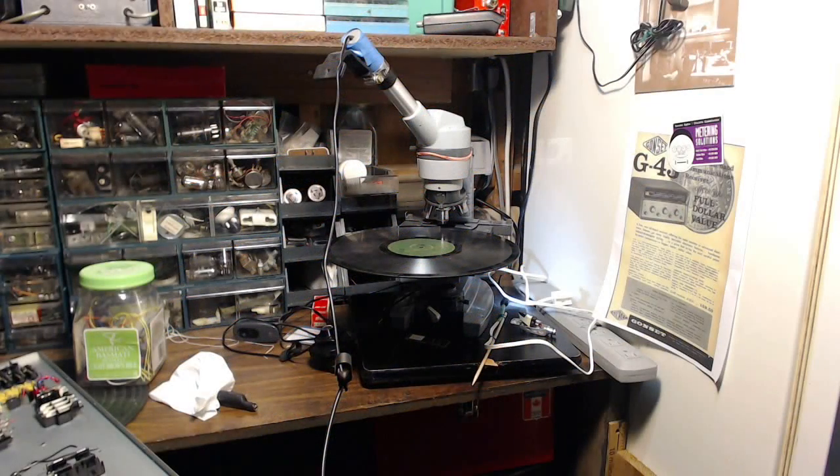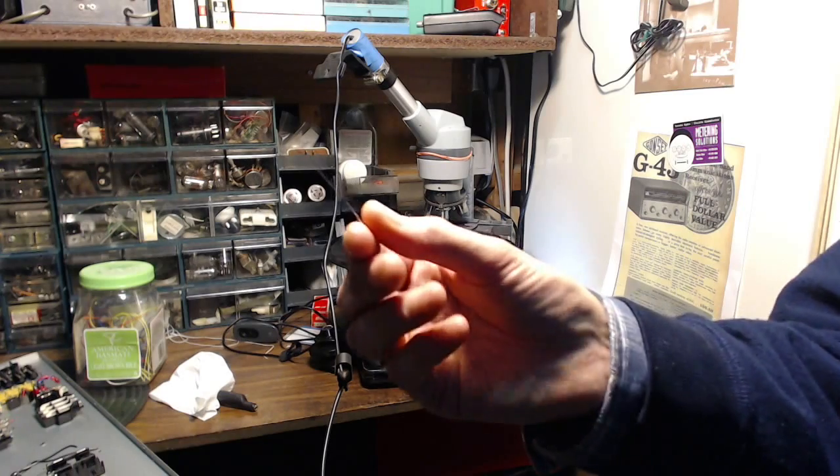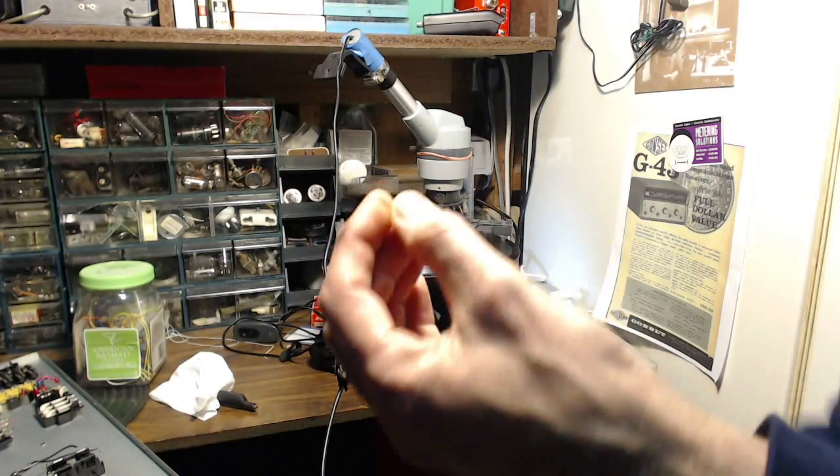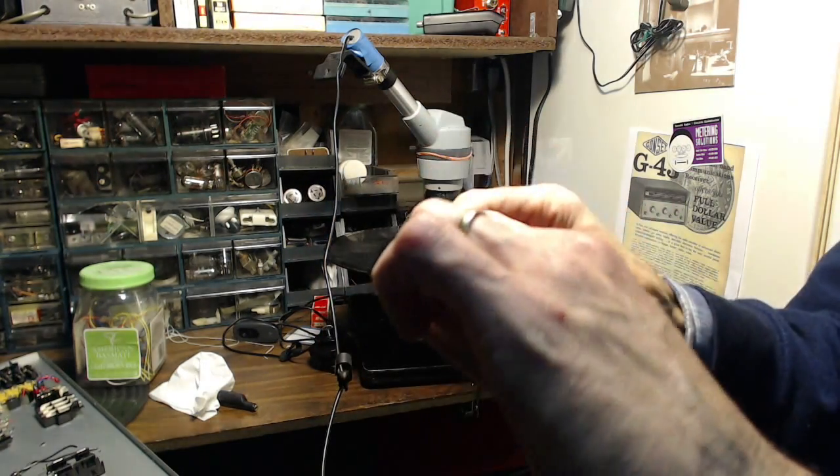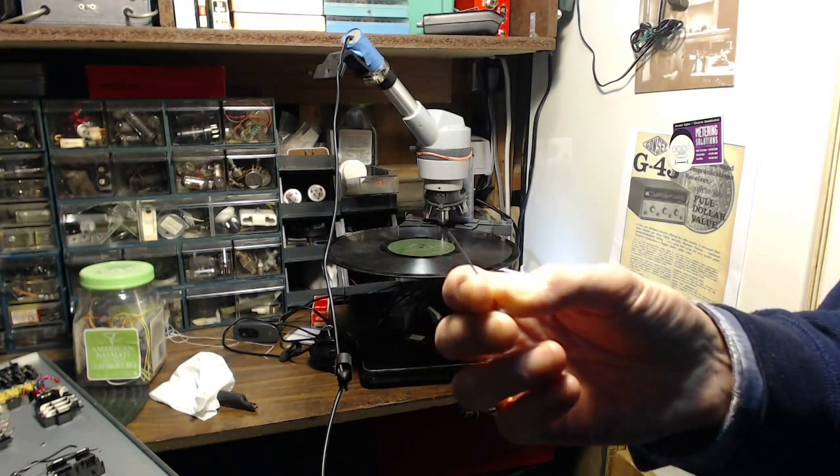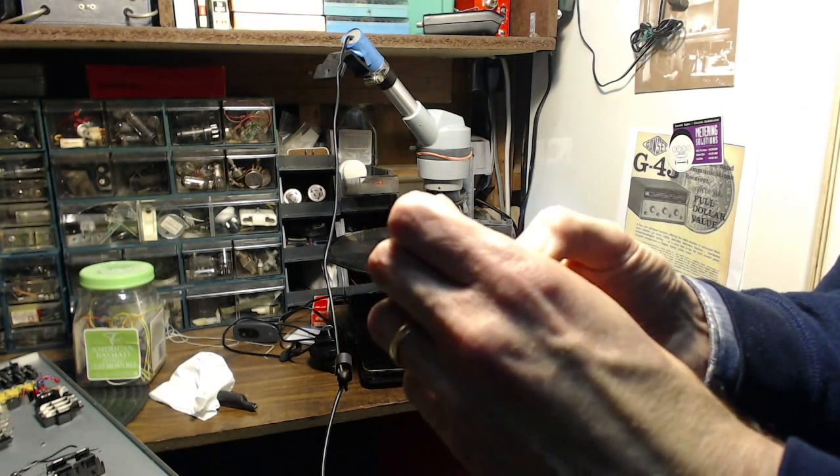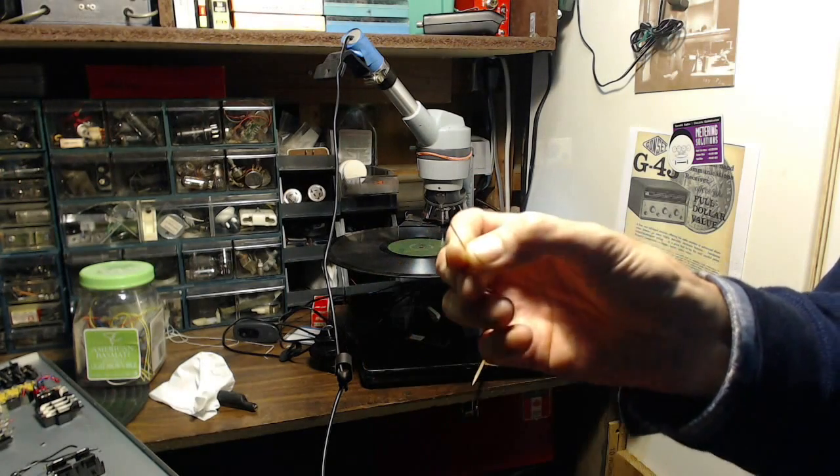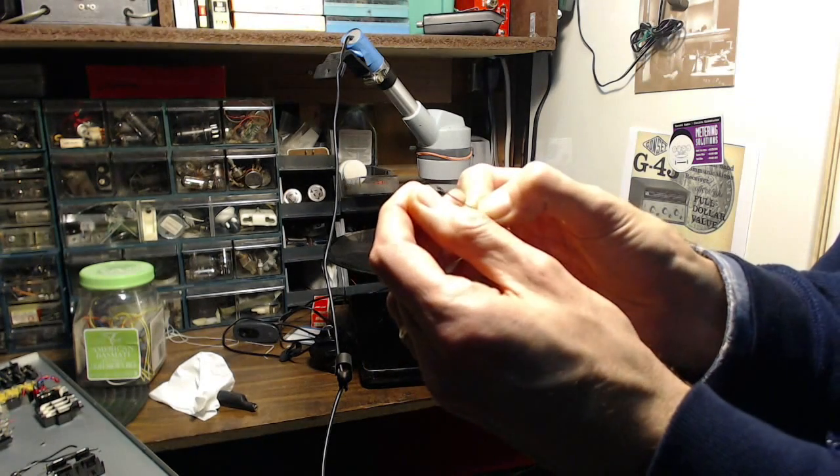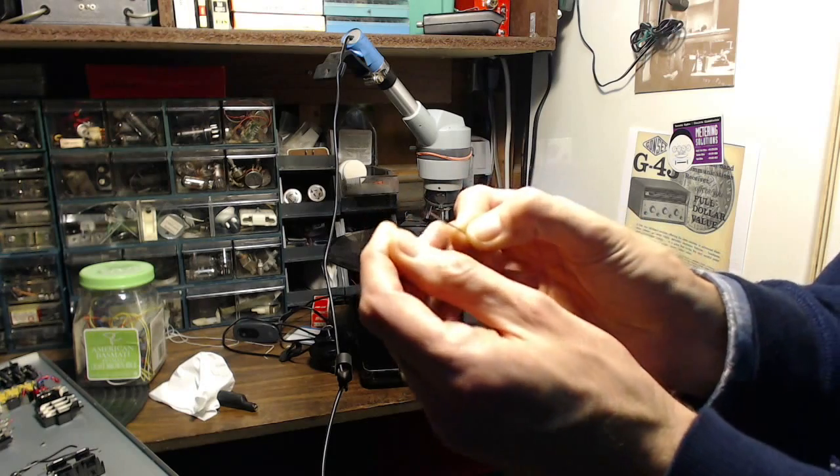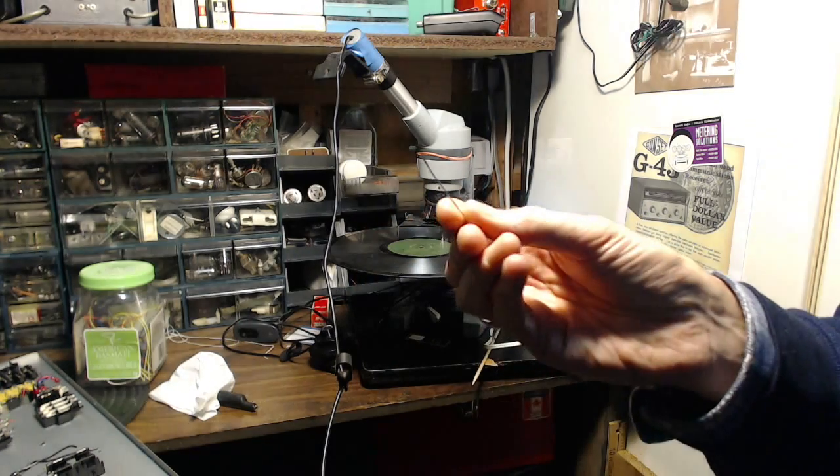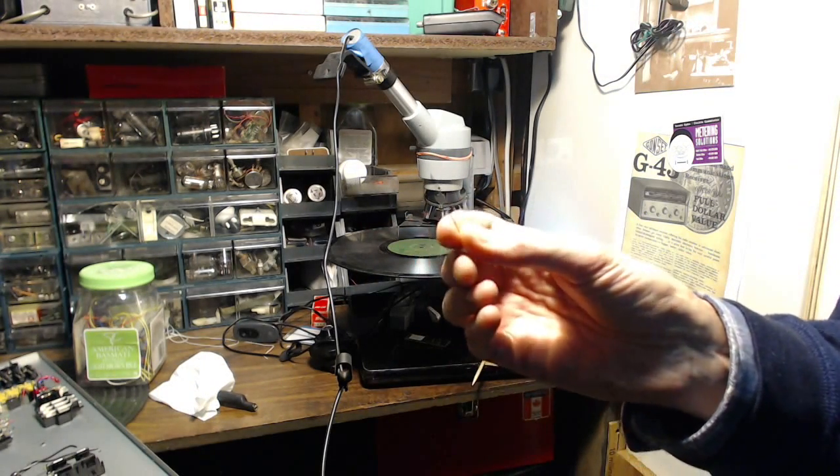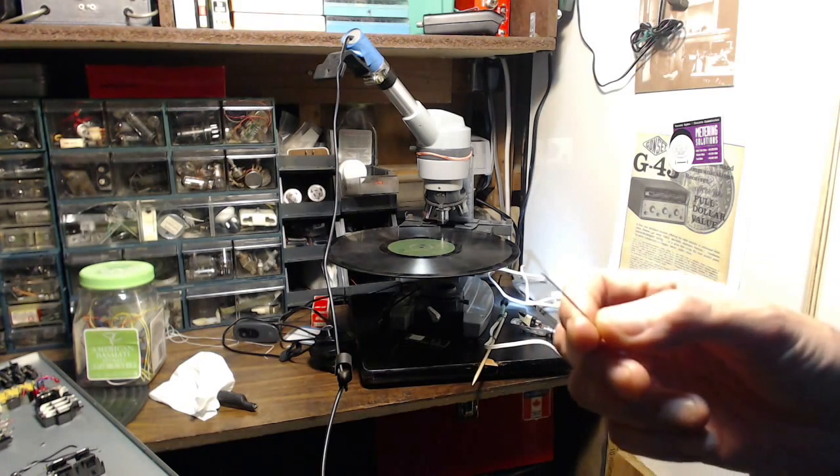Now just to make this interesting, I have a hat pin. Just an ordinary run of the mill hat pin. This one's been around for a long time. The tip of it has a funny hook in it. It's a little bit distorted but that actually means there's a little tiny teeny pin on the end of this pin. You can think of it that way.